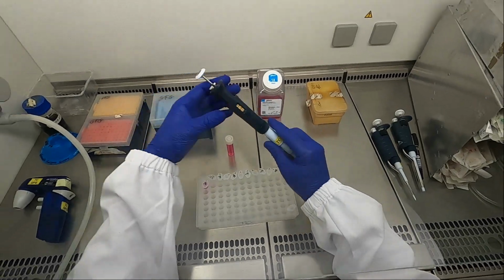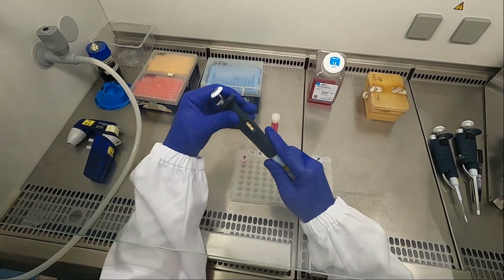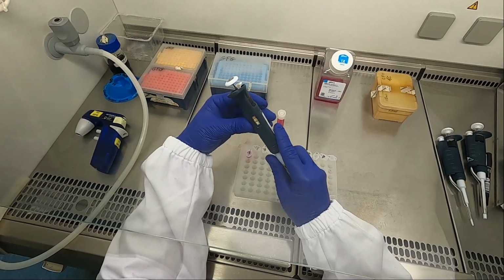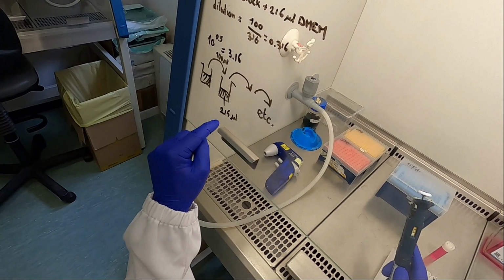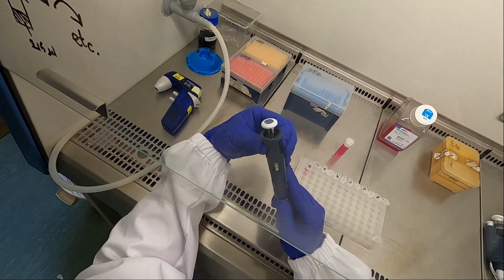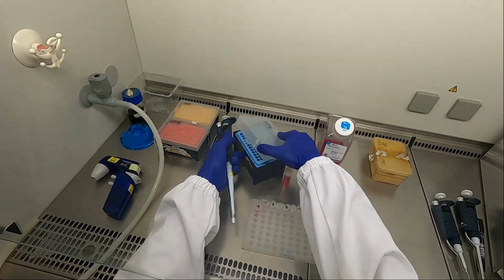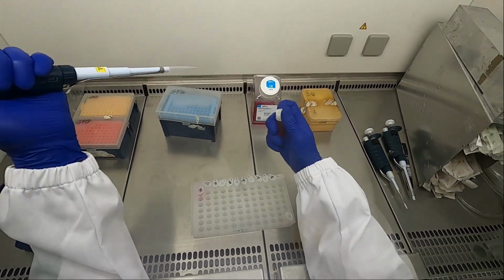So 216, we need the P1000 for that. We cannot do it with a P200 because it's just over the volume that it allows you to pipette. So 216, I don't know if you can see that. We take a blue tip and we start filling the tubes from A2, A3, all the way down to A12.